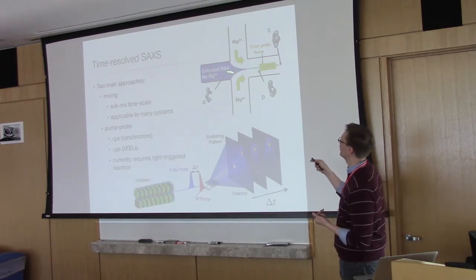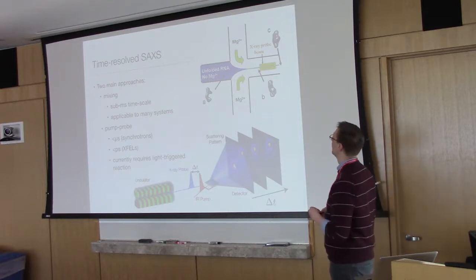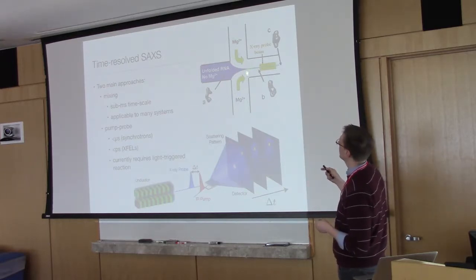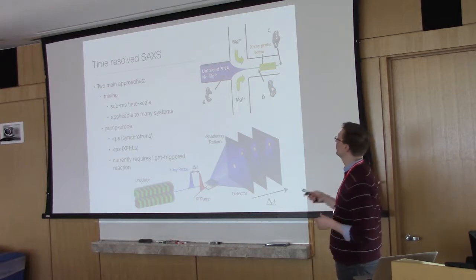So you have your unfolded RNA, bring in magnesium, a lot of times through microfluidics nowadays to have fine control, but you can do it with just flow cell geometries. And you flow these together, and then as a function of time, the molecules of magnesium are diffusing into the jet of RNA, the stream of RNA, and causing it to fold over time.